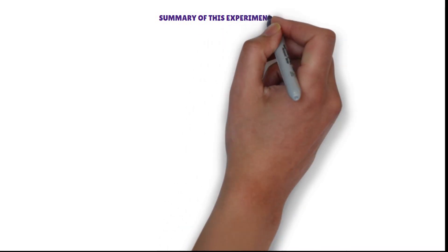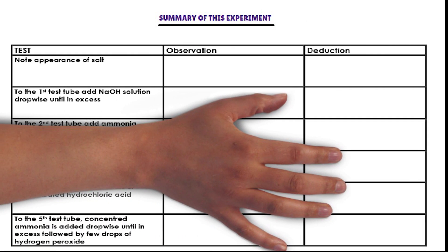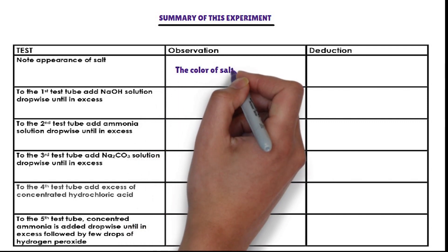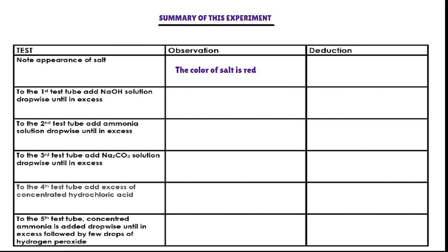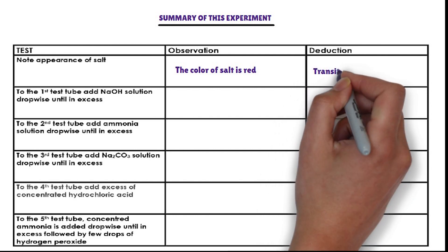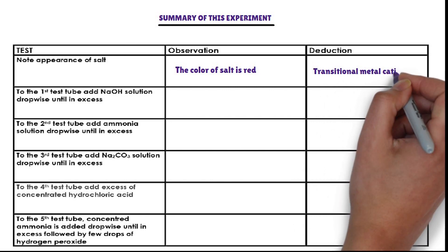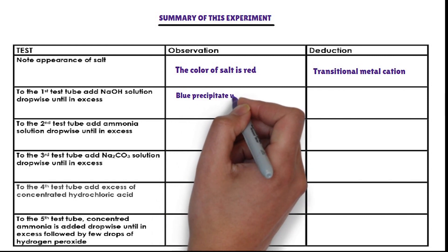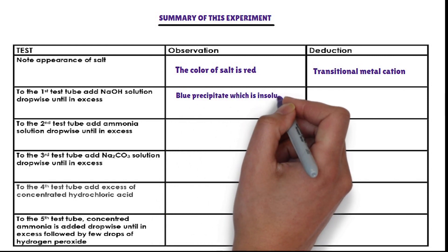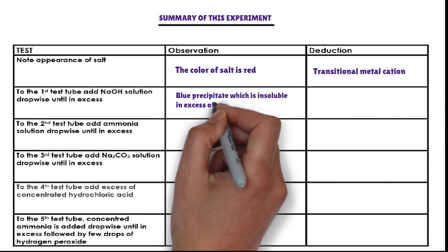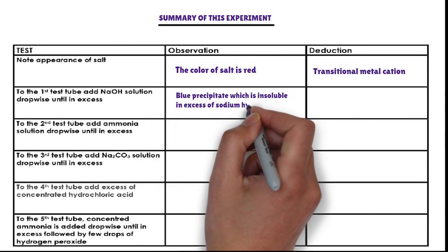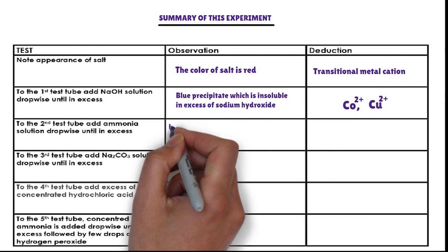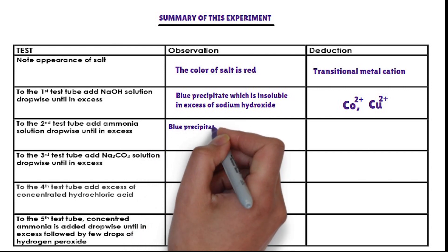Summary of this experiment. Observation: the color of the salt is red. The red color of salt indicates that the cation present in the salt is a transition metal cation. To the first test tube, sodium hydroxide is added dropwise. The cation that forms a blue precipitate with sodium hydroxide, insoluble in excess, is cobalt-2 ion or copper-2 ion.